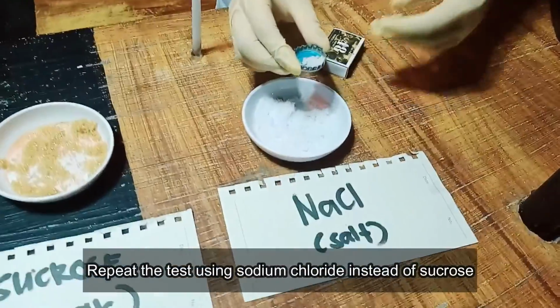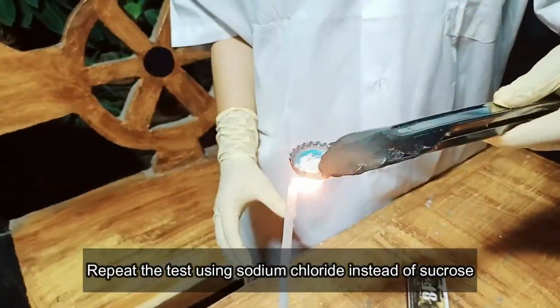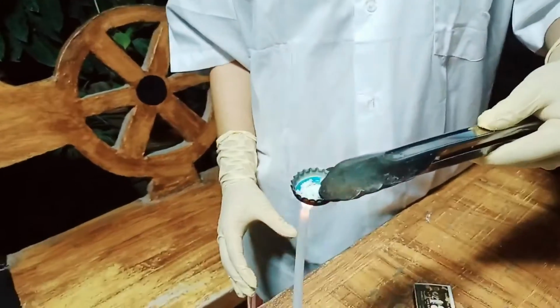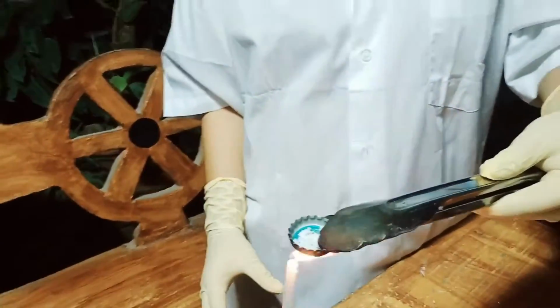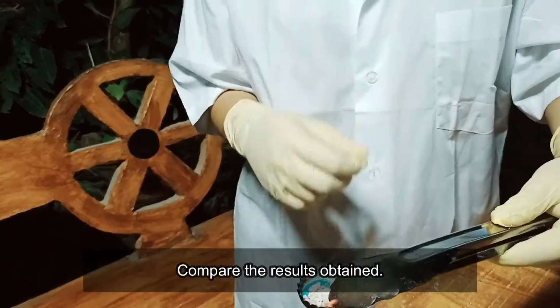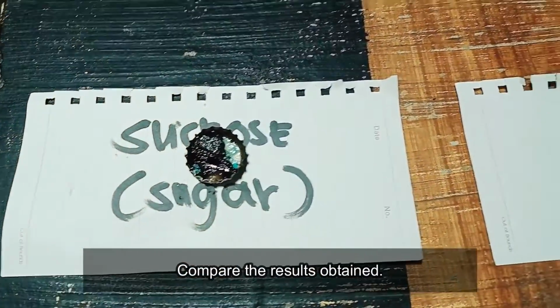Repeat the test using sodium chloride instead of sucrose, and then compare the results obtained.